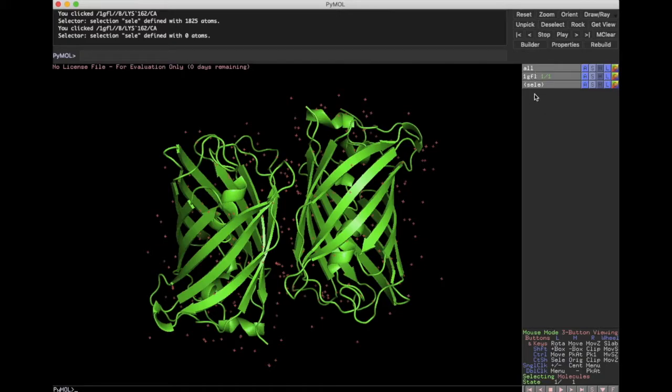There's really two ways to look at this section: vertically, there are three different lines here, and horizontally, a number of little boxes associated with each line. So really there's three levels of how and what you are going to change within this program.